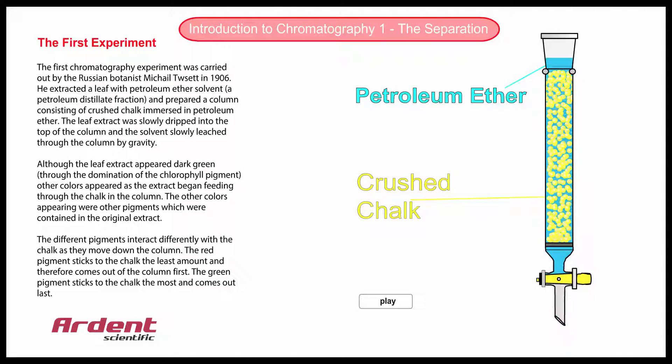You will notice that the three coloured bands are moving through the column and separating from each other. This is a slightly less complex separation than the first experiment over 100 years ago, but demonstrates the process quite well. The red band is attracted the least amount to the chalk particles and is running faster through the column. The green component sticks the most to the chalk and is running behind the other pigments. The blue pigment is sandwiched between the green and red pigments.